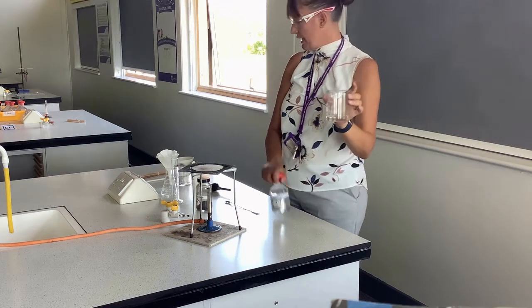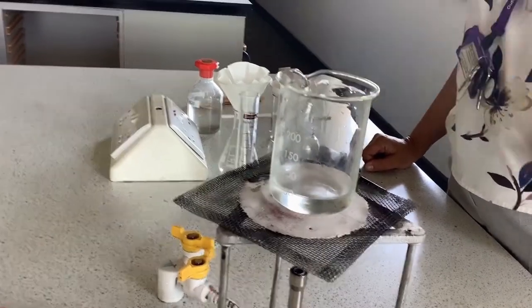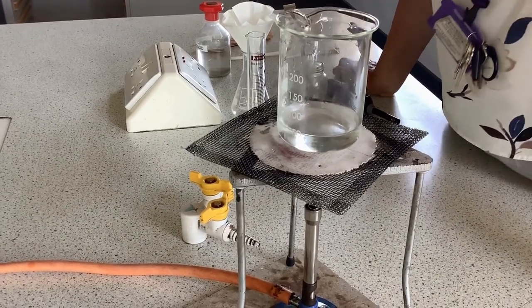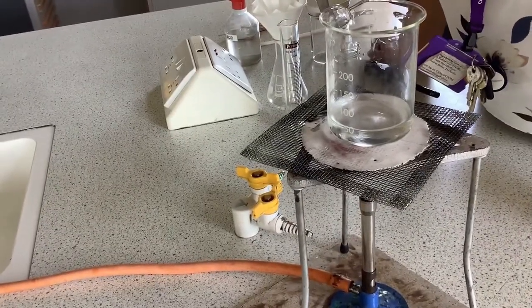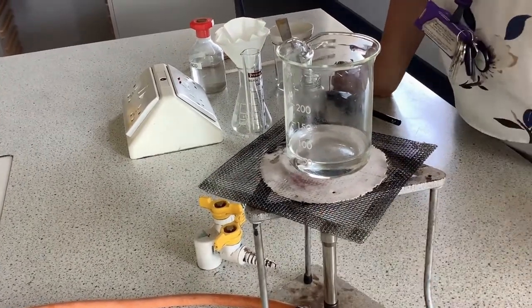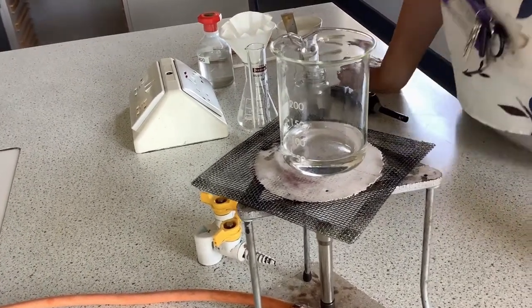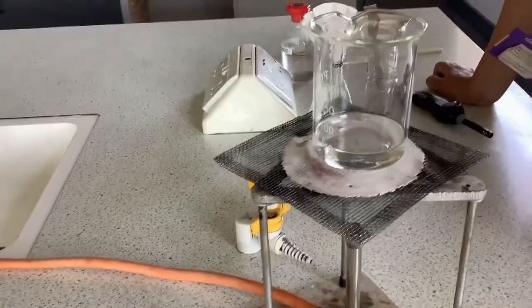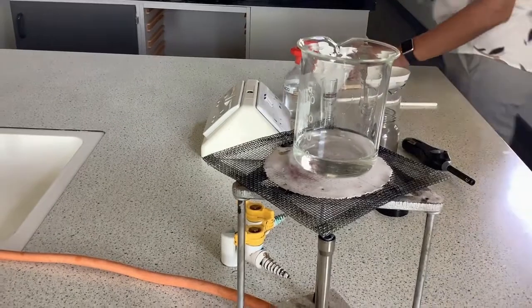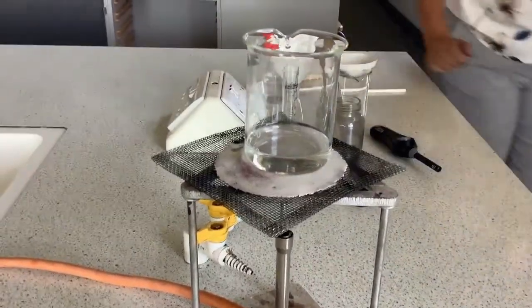You can see that sulfuric acid is colourless. So first of all, I am going to heat the sulfuric acid. I'm not going to boil it because we don't want fumes of sulfuric acid being produced. And I'm going to heat it on a blue flame. Once you've heated your sulfuric acid, you can then turn off the Bunsen burner.